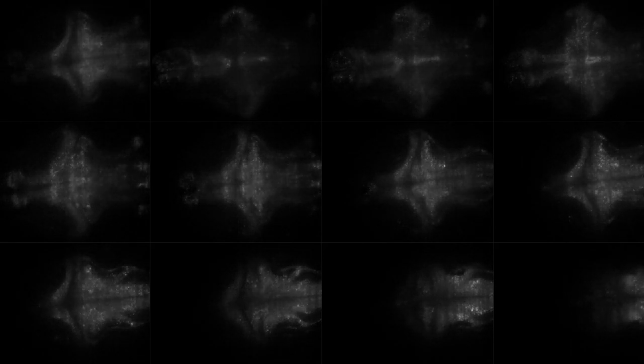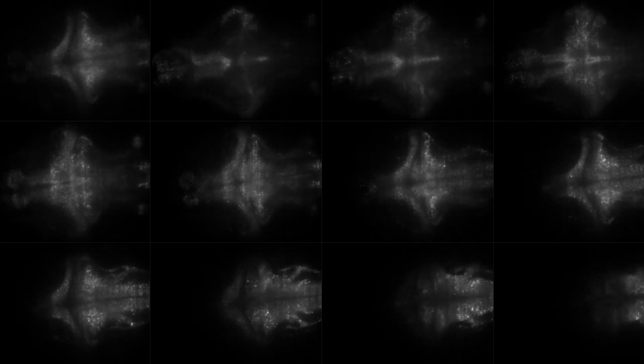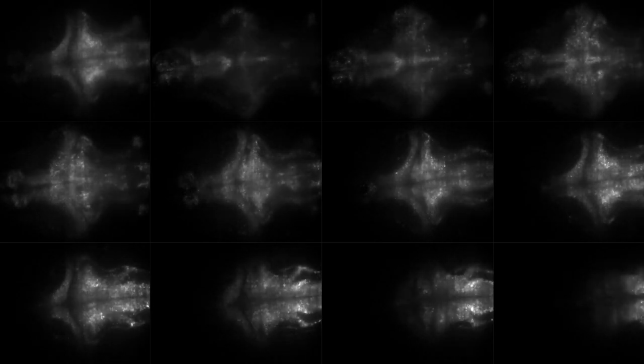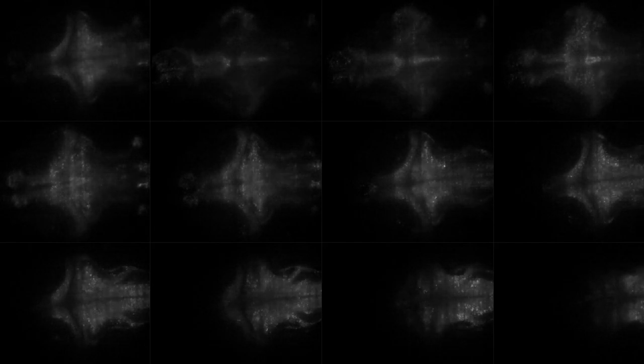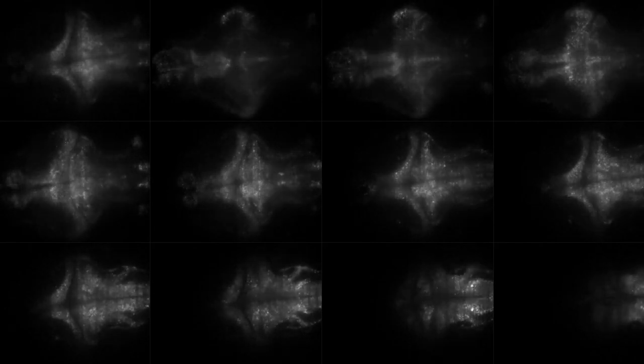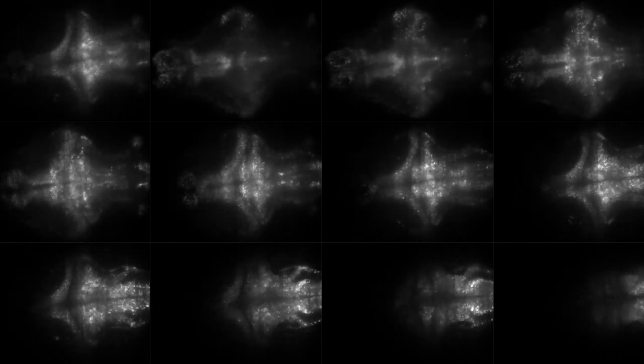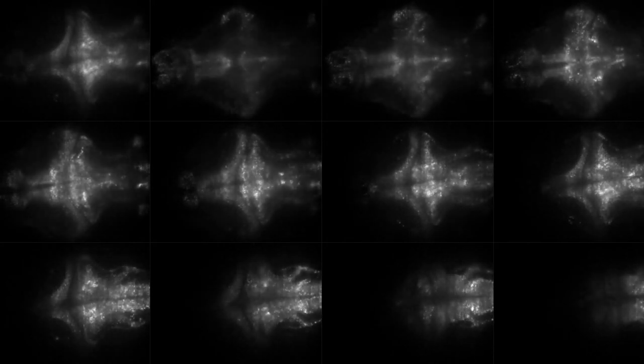After this procedure, we obtain a nice and stable volumetric video of the brain activity. There are still some small shifts, which result from big displacements that cannot be corrected. But it is ready now to extract signals.